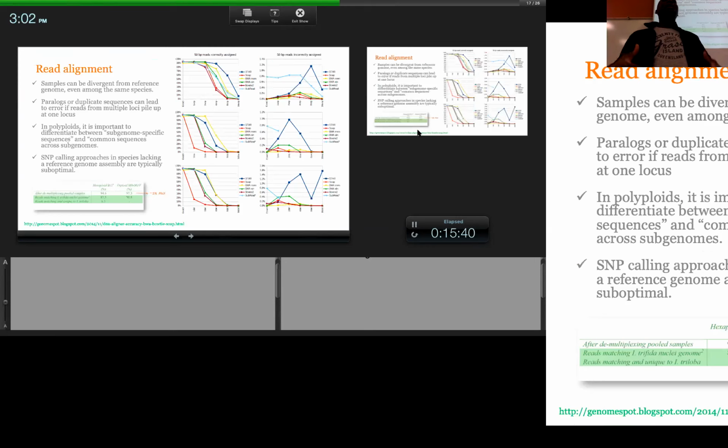So taking your reads and mapping it back to the reference genome is not exactly accurate, right? Because you're basically just saying, I'm taking this sequence, I'm matching it to the reference, and if it matches 100%, it's derived from that region, right? But I'm also looking for cases where it doesn't quite match, right? And I want cases where it doesn't quite match because that's how I discover my SNP, right?